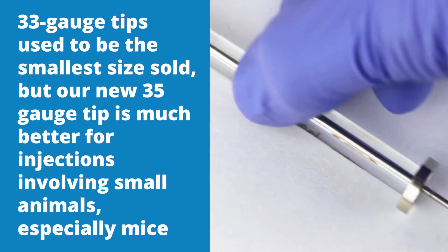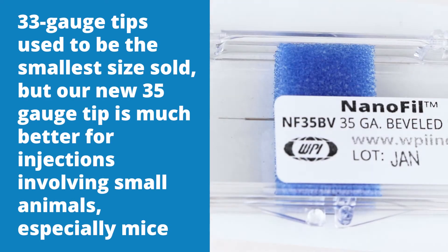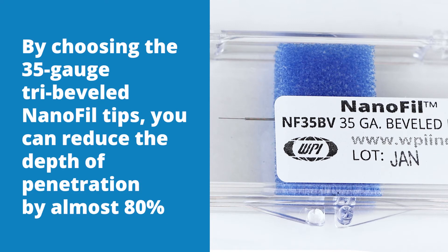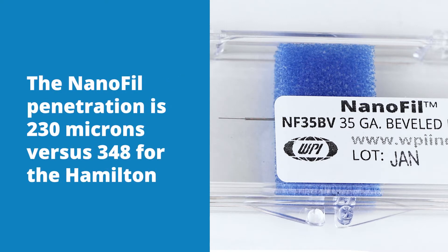33 gauge tips used to be the smallest sold, but our new 35 gauge tip is much better for injections involving small animals, especially mice. By choosing the 35 gauge tri-beveled Nanofill tips, you can reduce the depth of penetration by almost 80% when compared with Hamilton's 33 gauge 10 degree beveled tip. The Nanofill penetration is 230 microns versus 348 for the Hamilton.